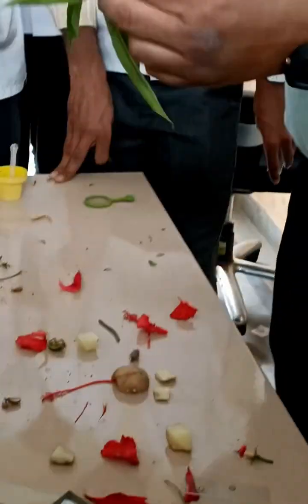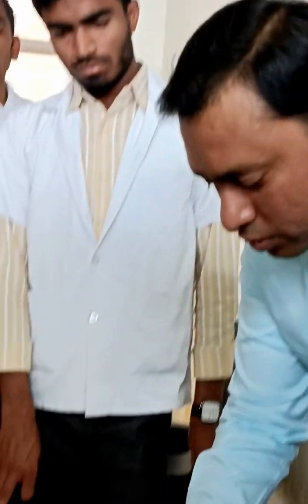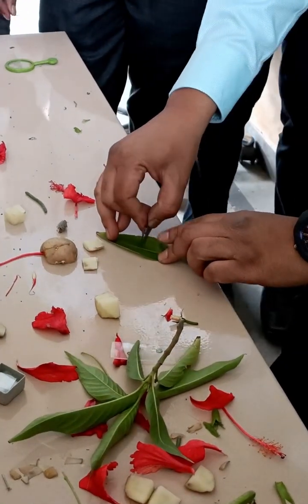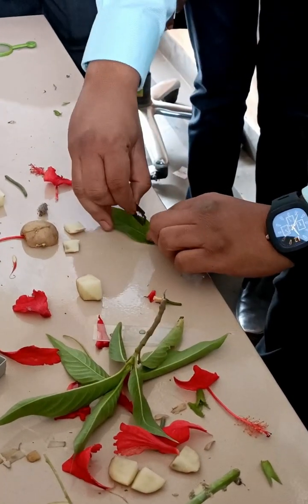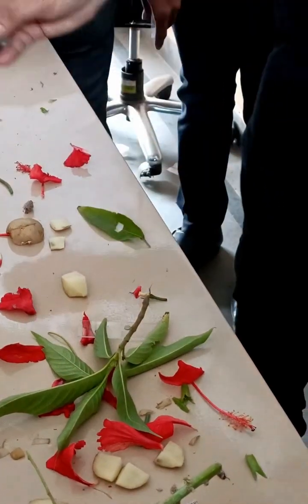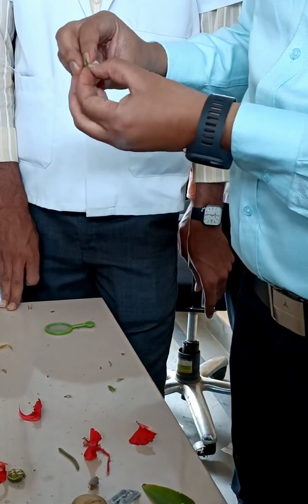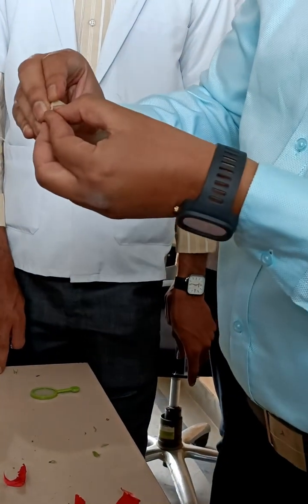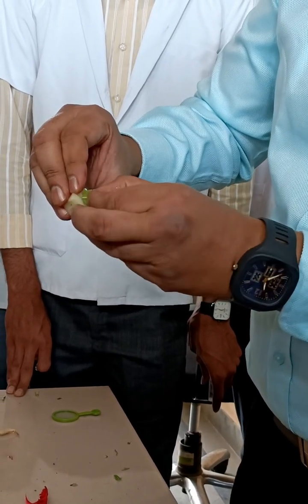Second, take a fresh leaf and cut the middle part — the midrib. Cut the midrib portion like this. Then take this middle part and insert it into the cut we made in the potato, like this.